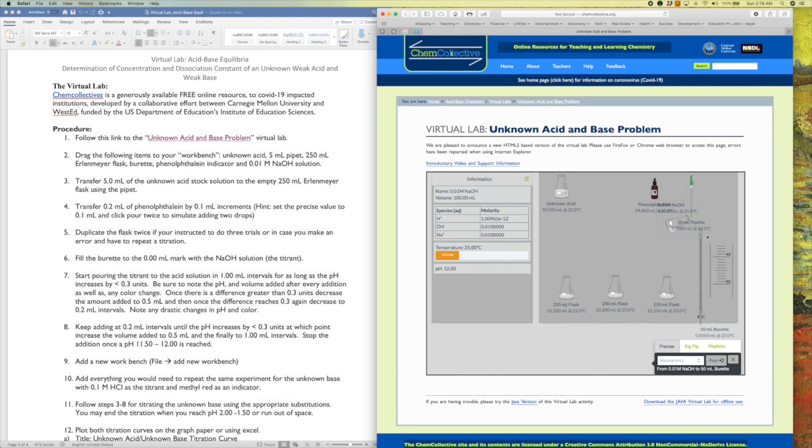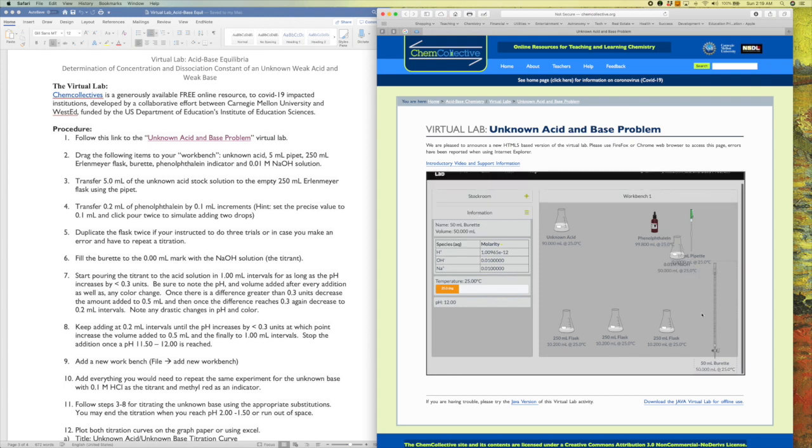And I want to fill this to its capacity. So I want to fill this burette to the 0 ml mark. And so I will say that I want to add 50 ml, right? So I'm going to pour 50 ml in this. And what you see now is that the solution has reached the 2 ml mark. The reason for that is remember that the graduated part starts here somewhere. There is a volume, an area beneath the 50 ml graduation that is not graduated.